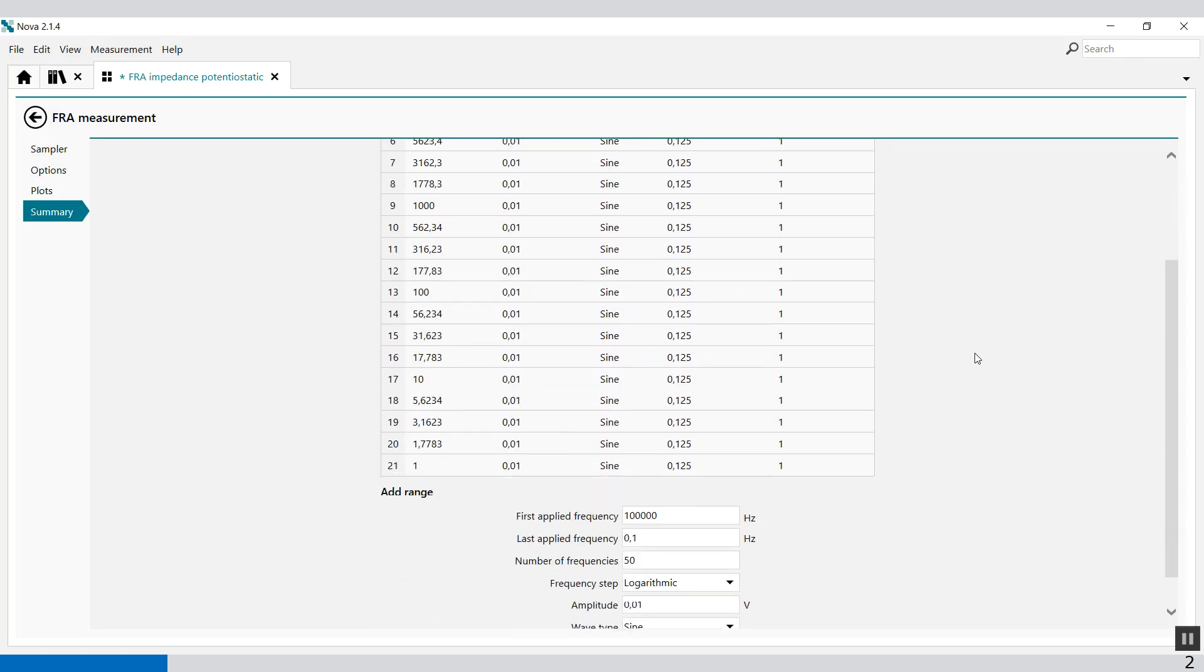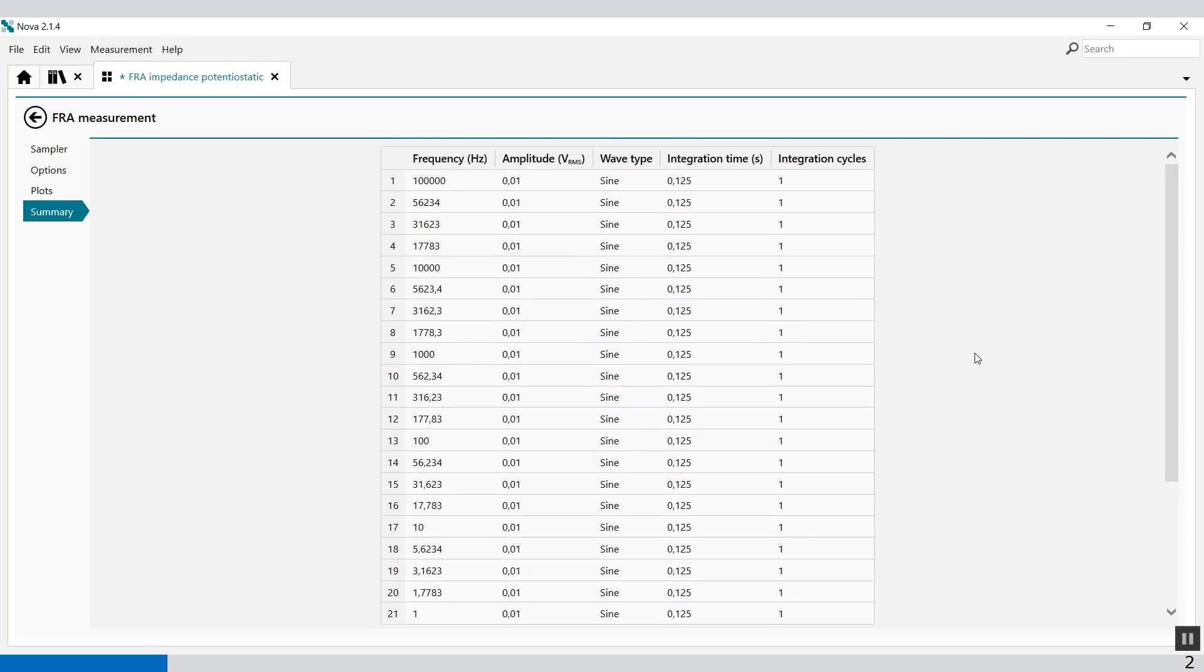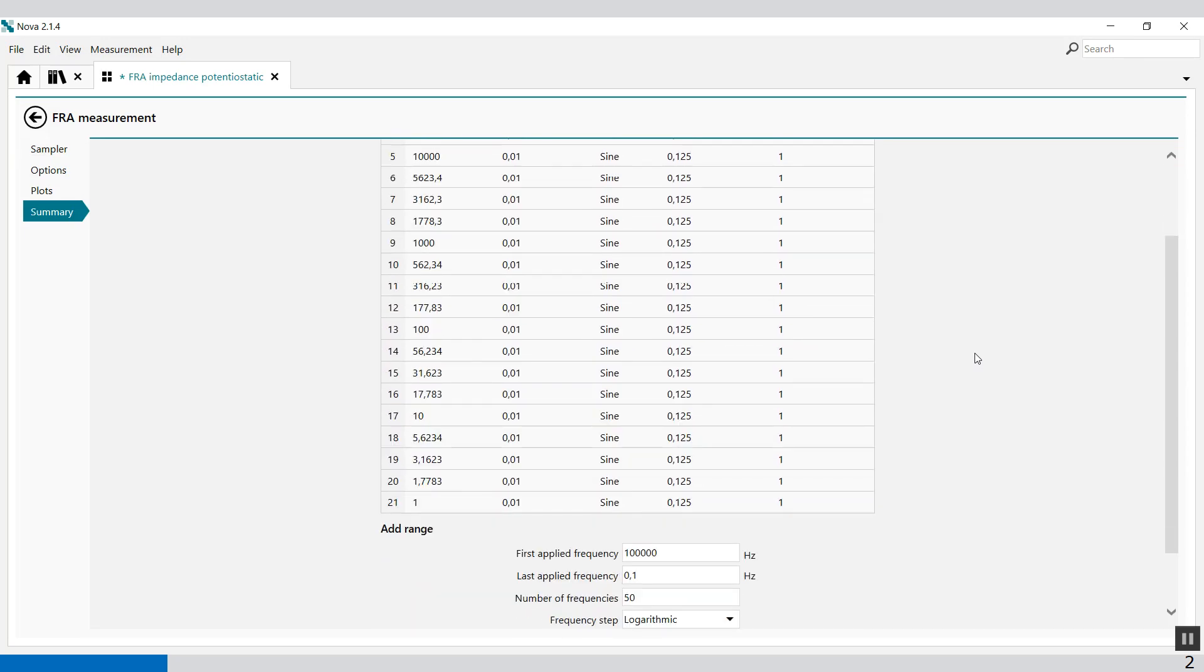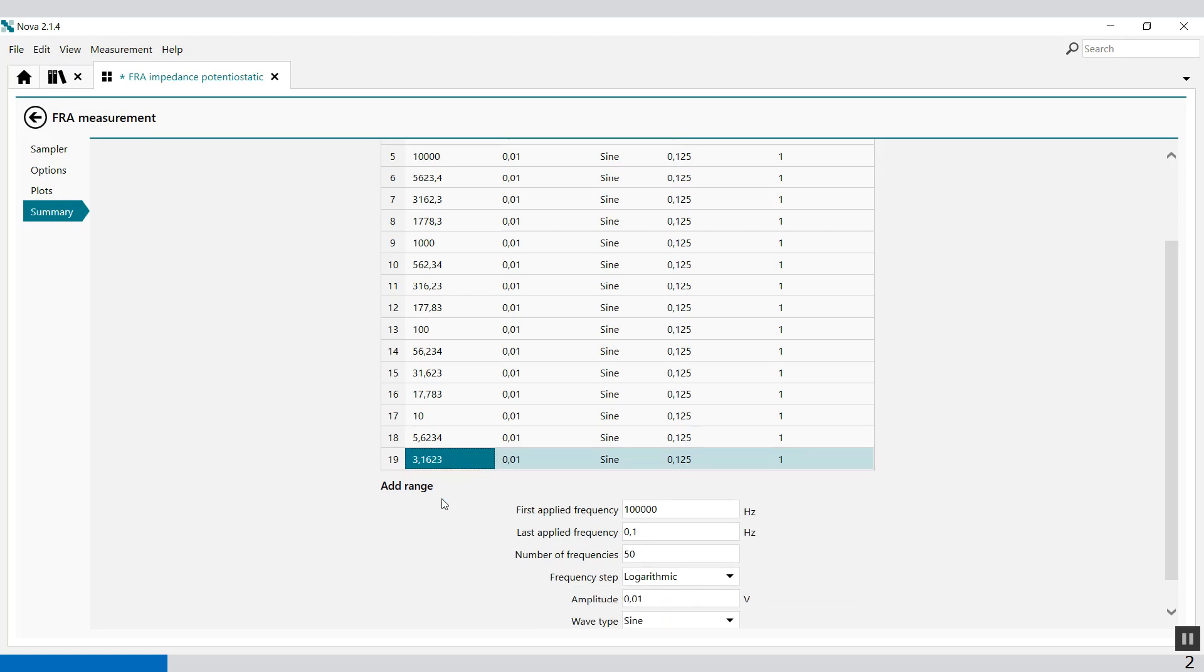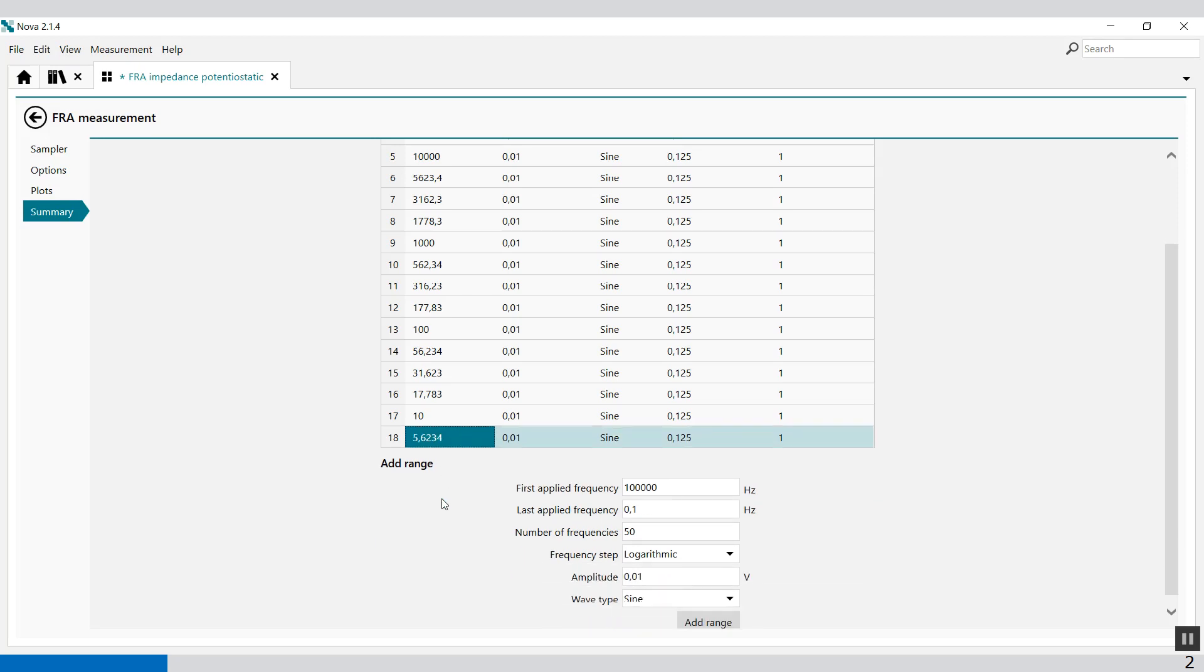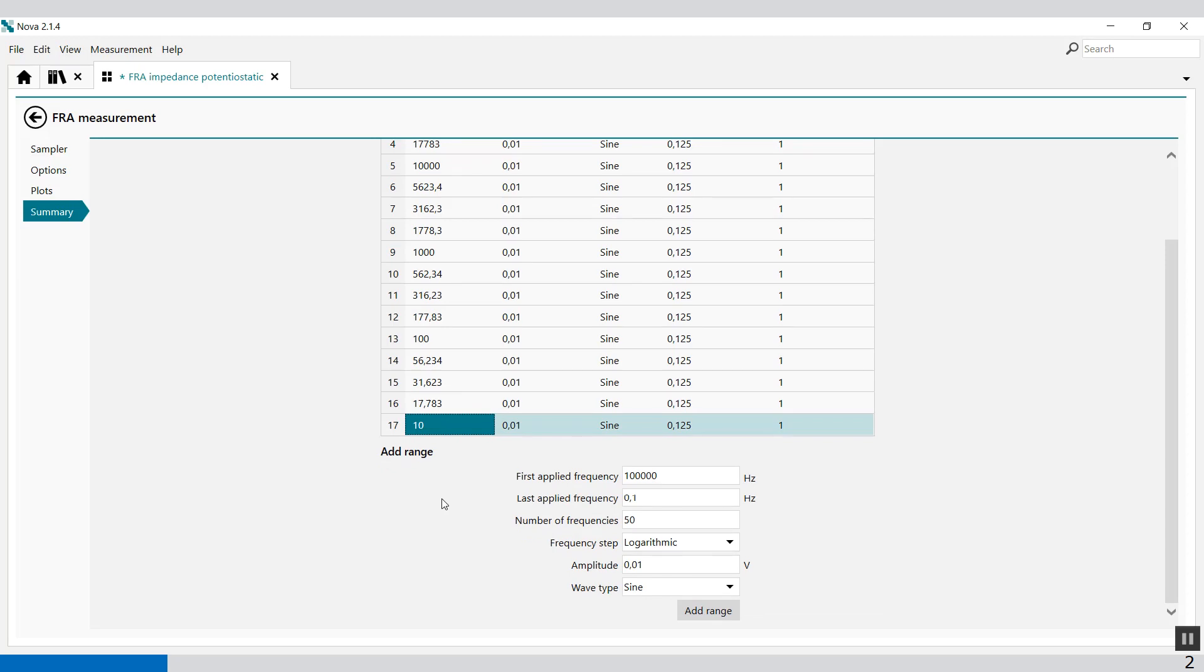Then we have the summary of the frequencies. Here you'll find frequencies. If you want to delete frequencies, you just select a line and press delete.